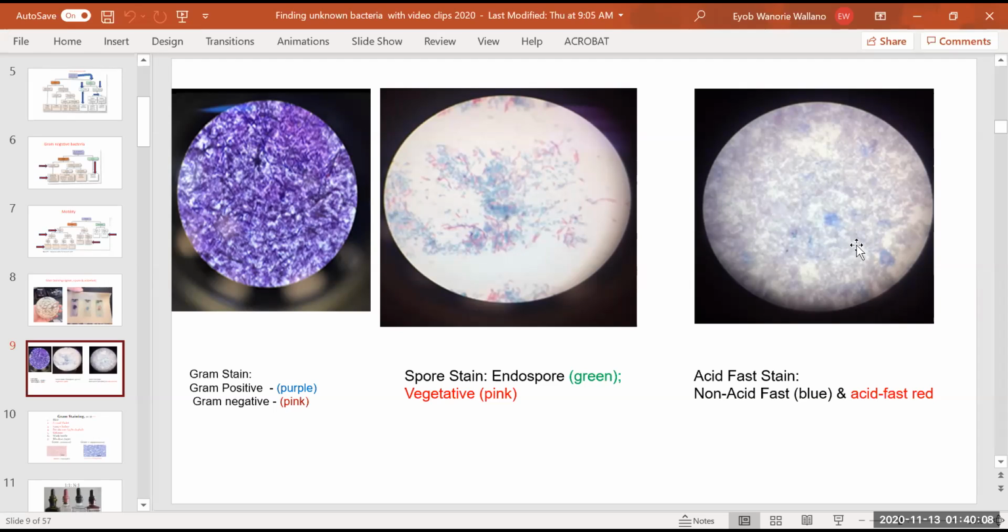After that, they want to prove it by the acid fast system. You see, very beautiful. Really, this is a very beautiful technique done by the student. My student, I've done it. Okay, now look here, this one.